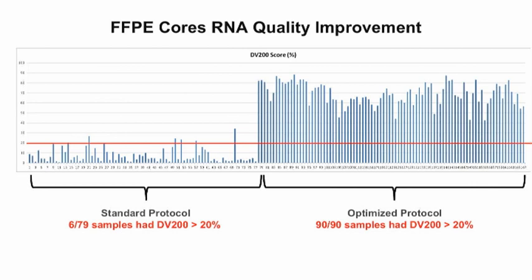It almost seems as though the reverse was true for the QIAGEN protocol, the standard protocol, that the cores performed less well than the slides, but at least again in this case, clearly a dramatic improvement. This is all on the RNA side. If we look at DNA, yields are good. The improvement on the DNA side is modest to insignificant. But this is again clearly an RNA improvement.